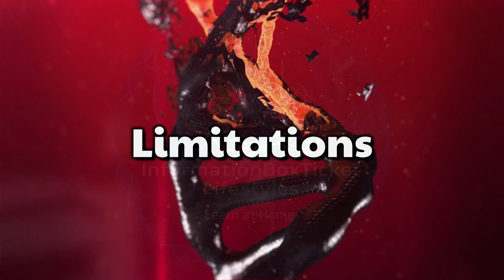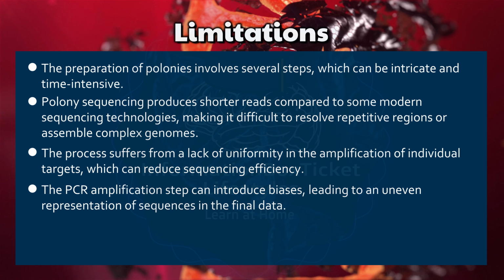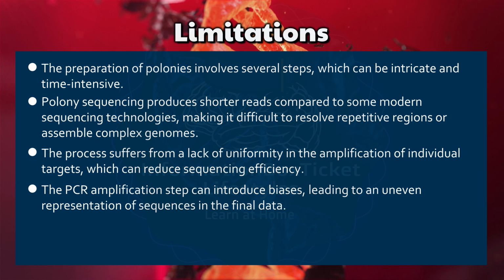Limitations of Polony sequencing. The preparation of polonies involves several steps, which can be intricate and time-intensive. Polony sequencing produces shorter reads compared to some modern sequencing technologies, making it difficult to resolve repetitive regions or assemble complex genomes. The process suffers from a lack of uniformity in the amplification of individual targets, which can reduce sequencing efficiency. The PCR amplification step can introduce biases, leading to an uneven representation of sequences in the final data.